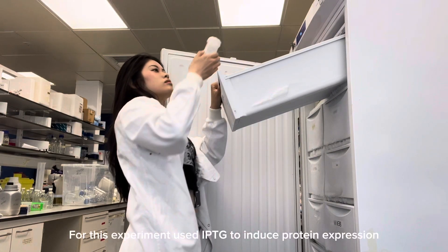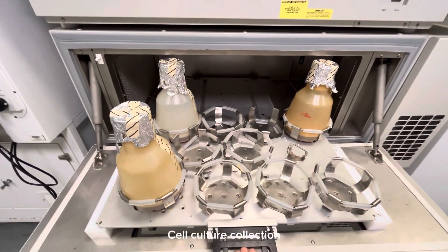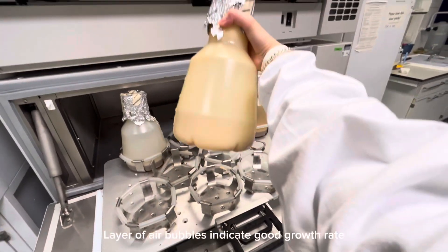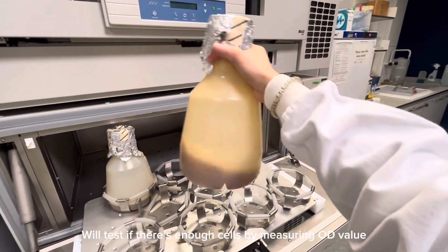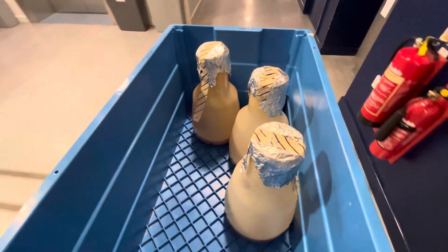For this experiment I've used IPTG to induce expression. This foamy layer indicates a really good growth rate, so now I would have to see whether there's enough cells by measuring the OD value.